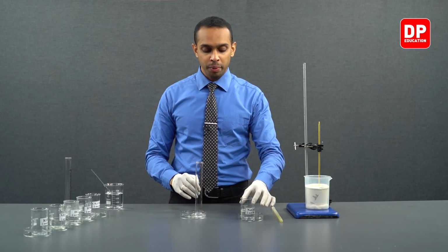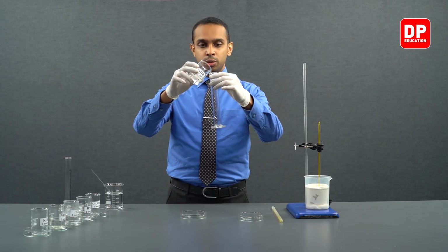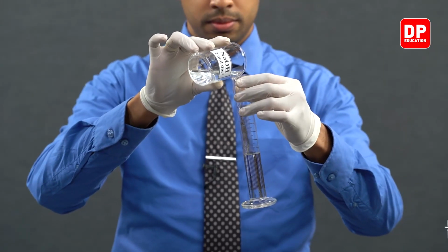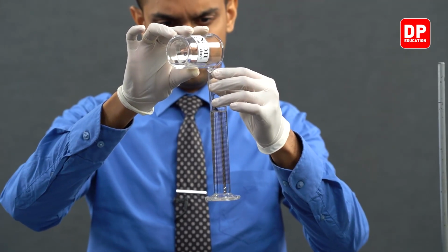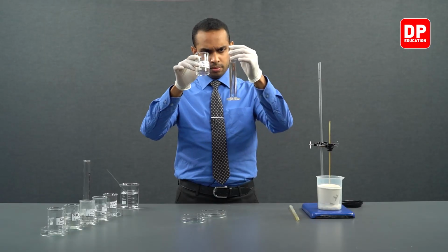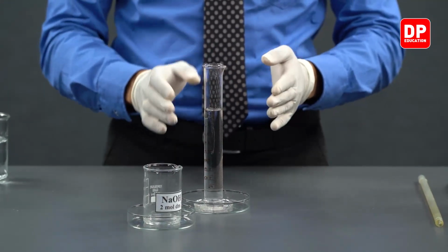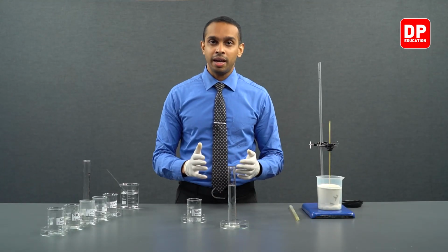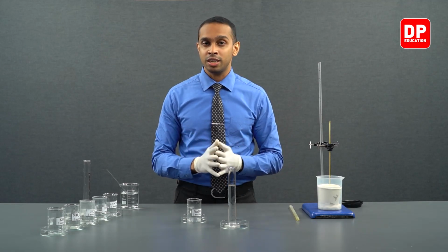Now we are going to measure 50 milliliters of sodium hydroxide using a measuring cylinder. And after measuring 50 milliliters of sodium hydroxide, we have to be prepared to close the lid of this setup and take a look at the highest temperature that the reaction mixture is reaching.